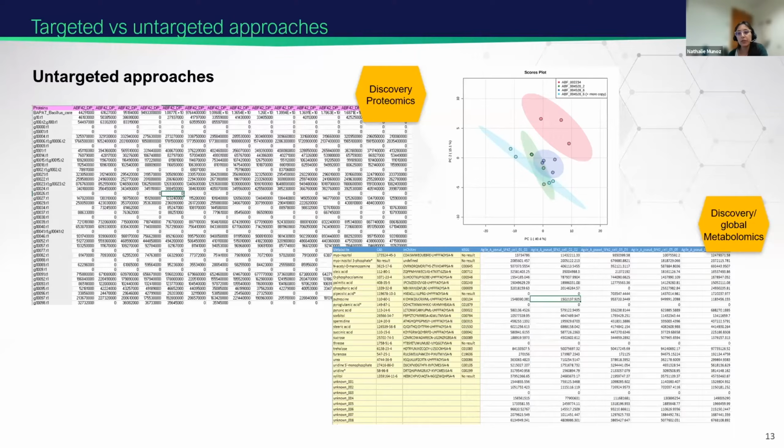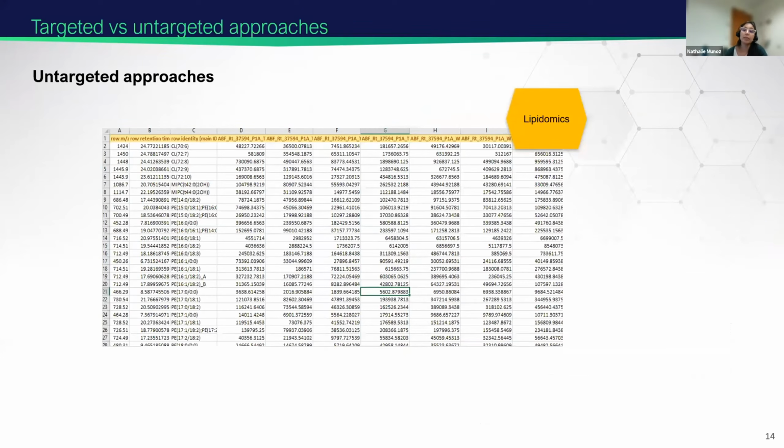Another omics that we use routinely at PNNL, but we won't have a full day dedicated to, is lipidomics. So I want to spend some short time discussing lipidomics. And lipidomics is usually done also in the untargeted global mode. In this case, peak apex intensities of lipids detected in the samples from vastly different subclasses are reported. So this is what we're observing in the table.